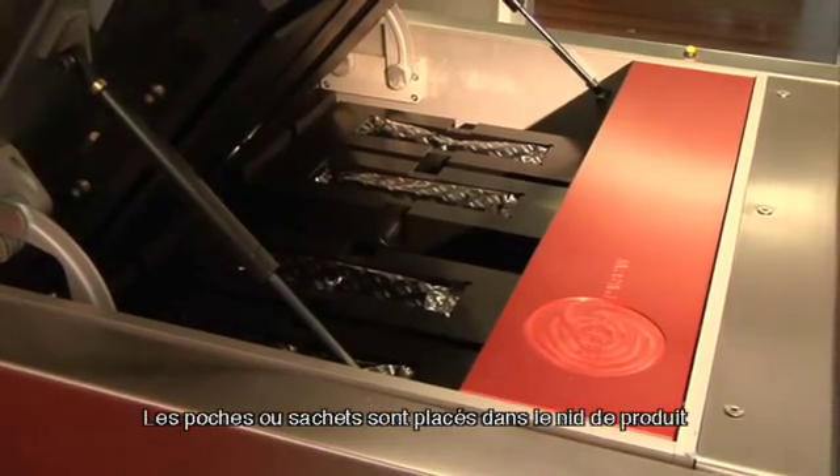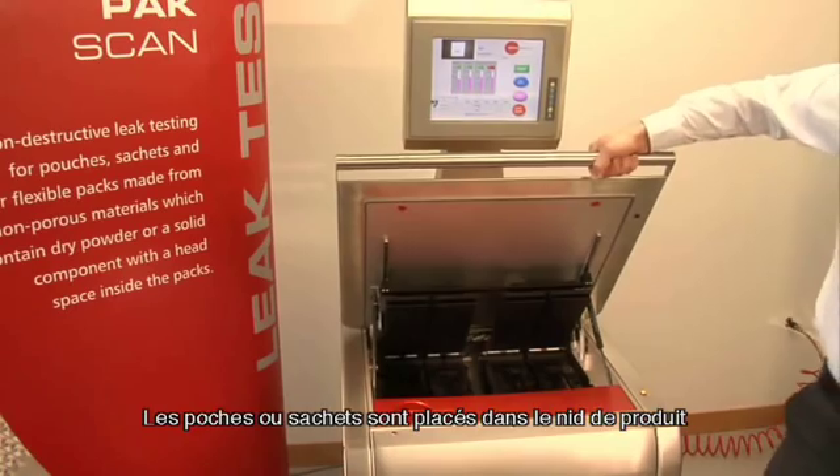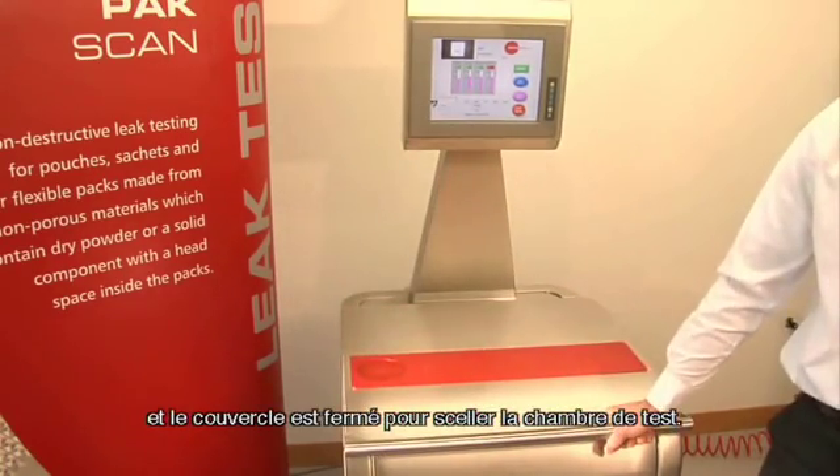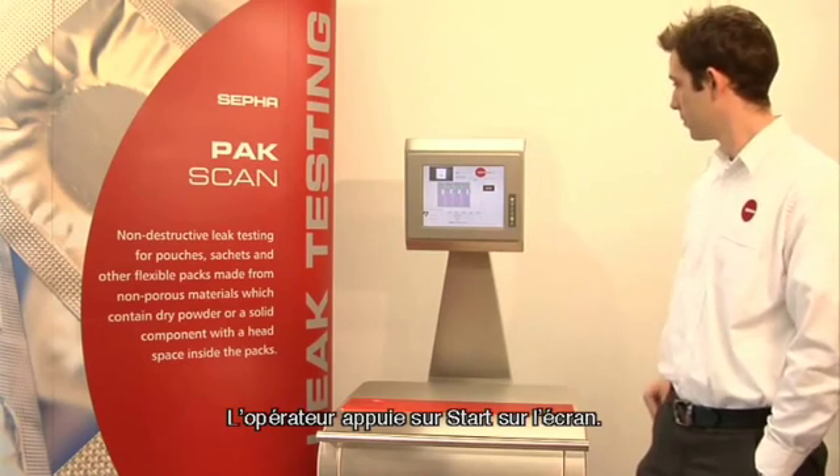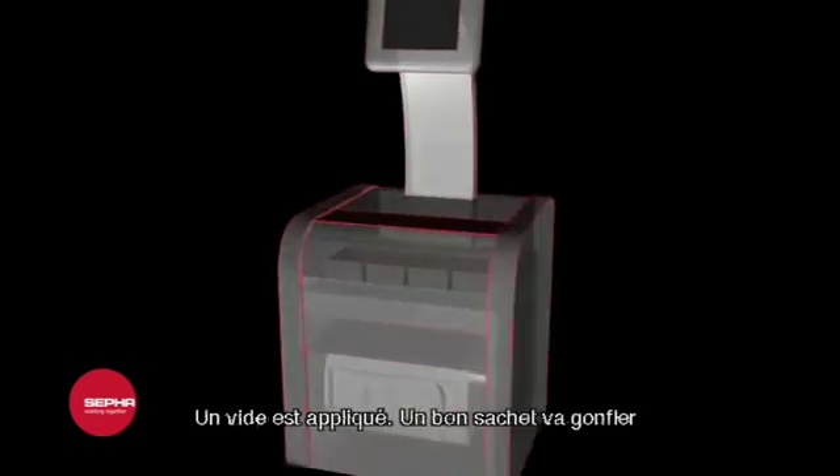Pouches or sachets are placed into the product nest and the lid is closed to seal the test chamber. The operator presses start on the screen and a vacuum is applied.